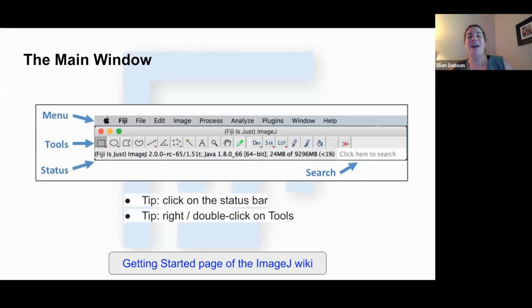Okay, it's not the fanciest of software platforms as far as its aesthetics. And we know it's really not that remarkable looking. And we held on to the original design, but there's a lot going on under the hood. This is a very powerful software. It just doesn't like to show it all. It's not a very showy-offy kind of platform.